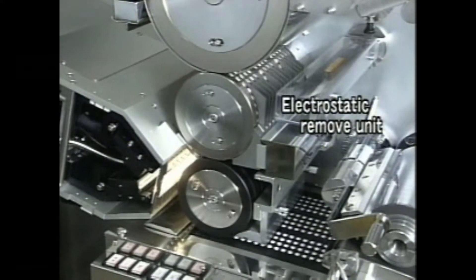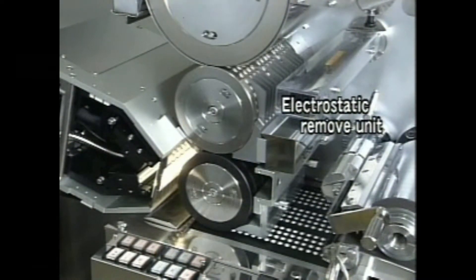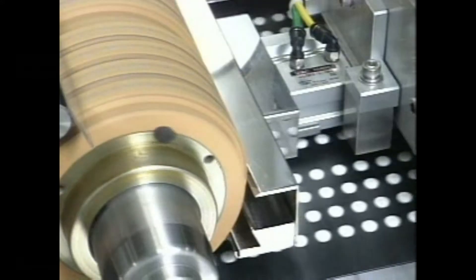After inspection, the tablets are transported horizontally to the slat in the most stable position according to their shape. After being transcribed to the rubber roll from the Etch Design Roll, the letters and marks are printed in the correct position on the tablet's surface.